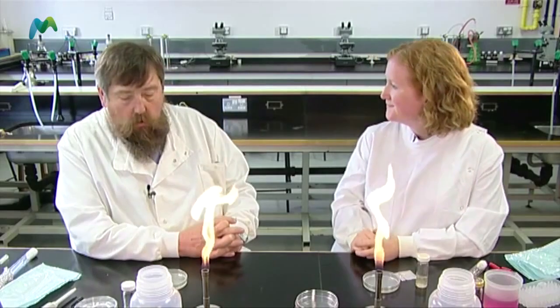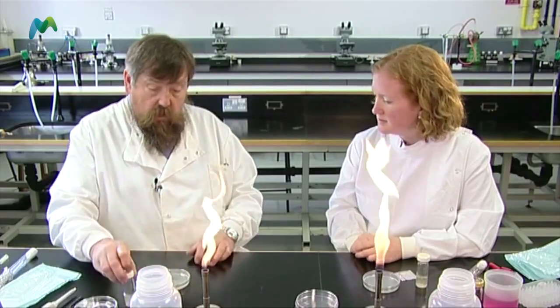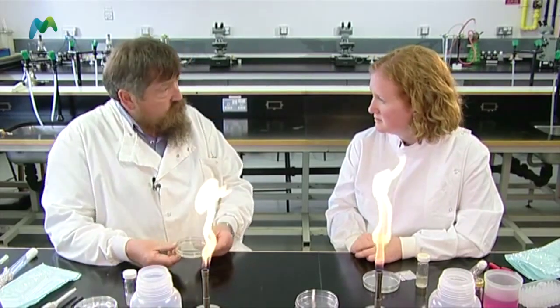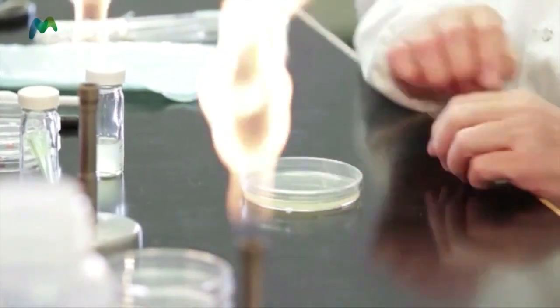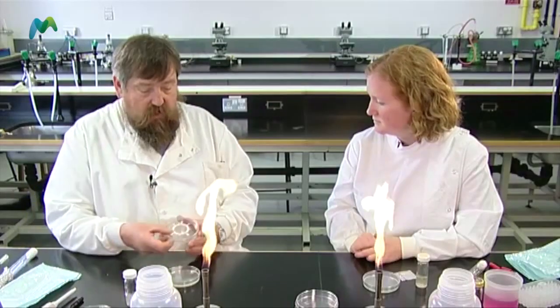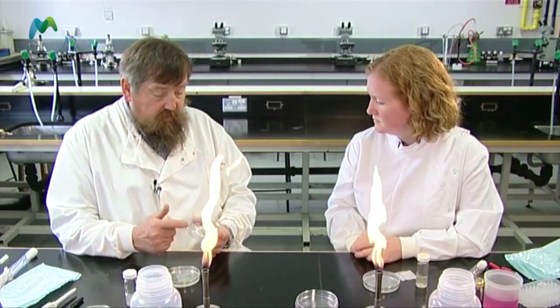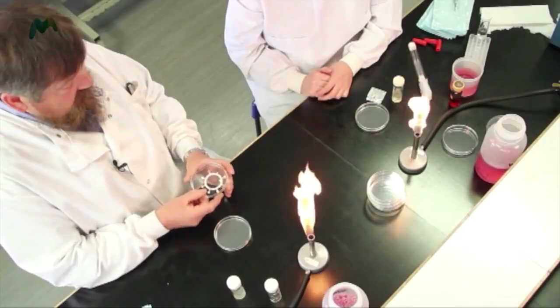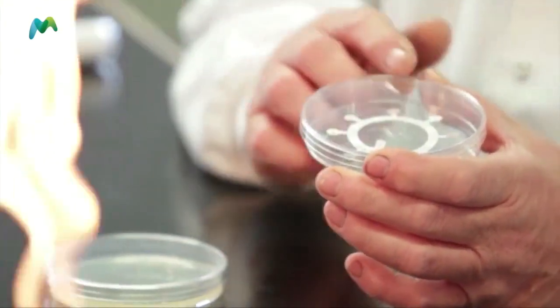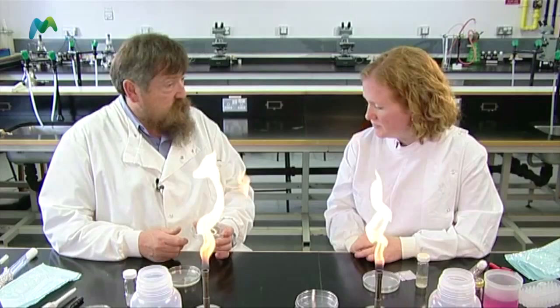What are we going to do? I'm going to make a spread plate. I'm going to take some culture and put it onto this nutrient agar plate and spread it to make a thin film. Then I'm going to take one of these multidisks that contains a number of different antibiotics, hoping that one or two or maybe all of them will have an inhibitory effect on the growth of the microorganism.